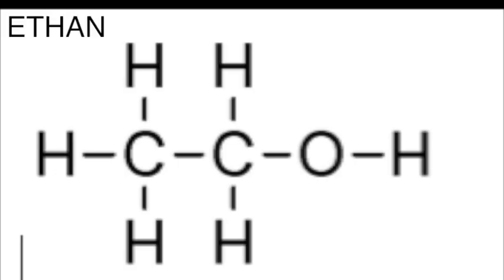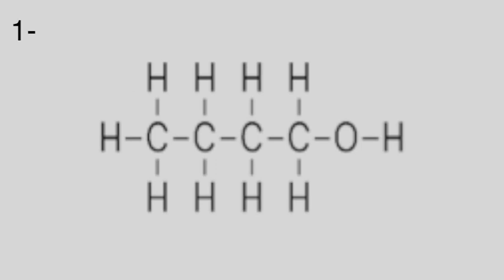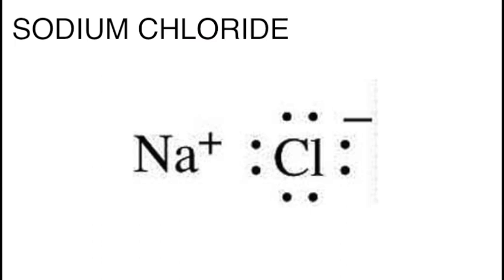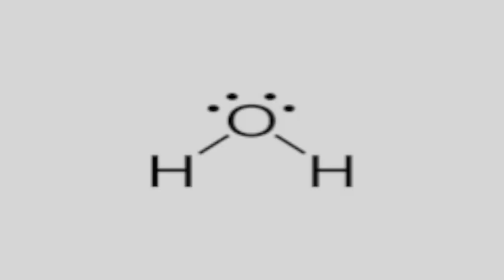Ethanol is a volatile, colorless liquid that is toxic when ingested in large amounts. Despite being colorless, 1-butanol can be distinguished by its pungent alcoholic odor. Sodium chloride is characterized by its clear, crystalline appearance when processed. Distilled water was also used in this experimentation.